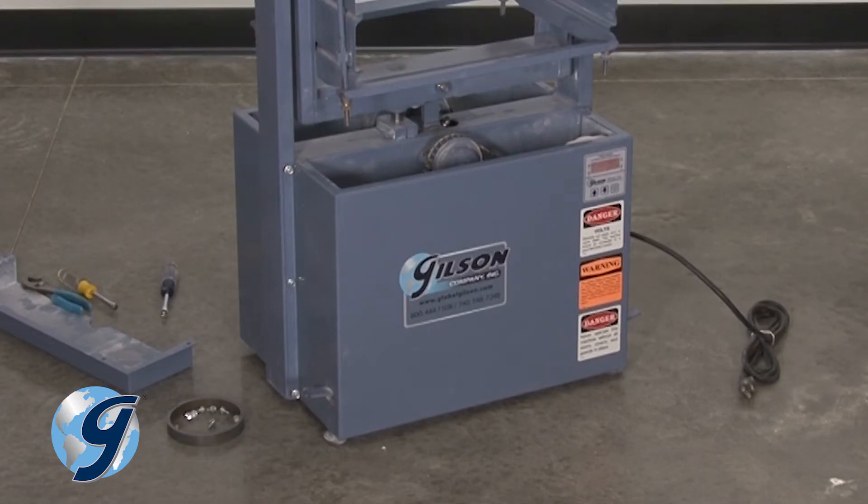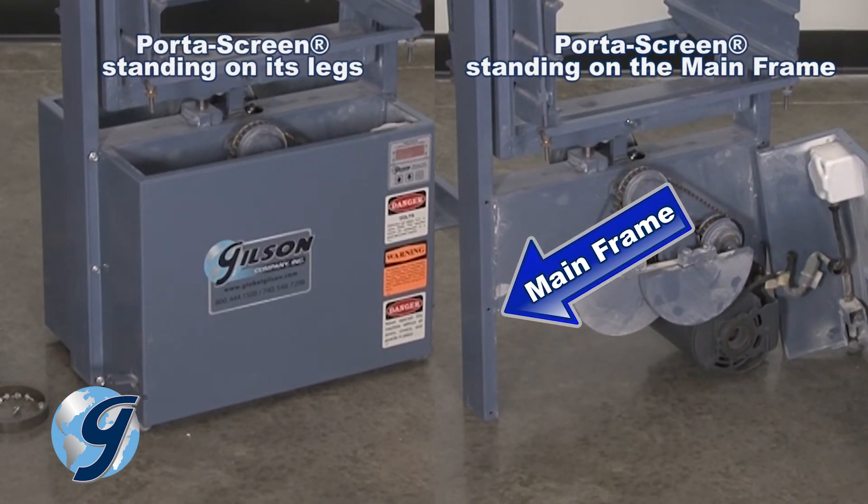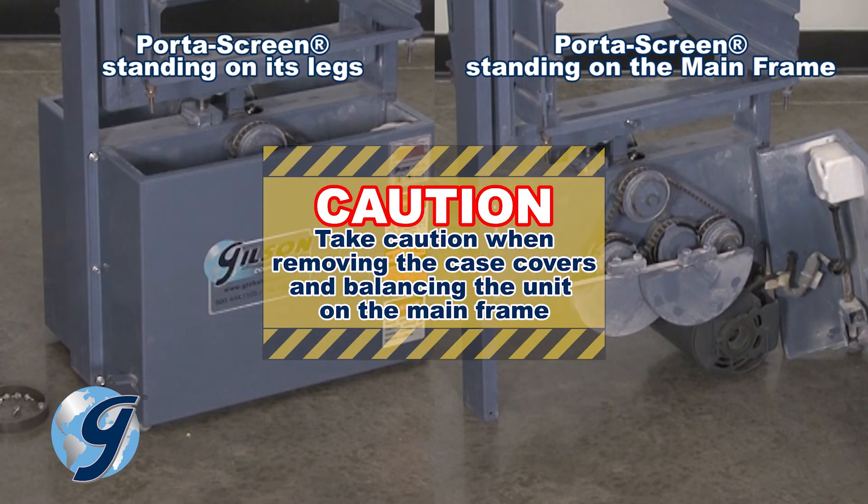Note the three leg leveling assemblies are attached to the case covers: two to the front case cover and one to the rear case cover. Once you remove the case covers, the unit will stand on its mainframe. Caution should be taken when removing the case covers and balancing the unit on the mainframe.